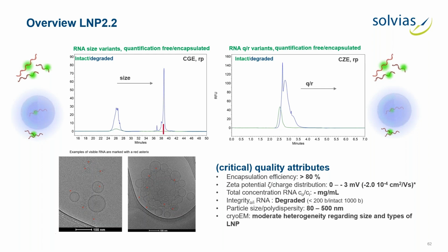It is really interesting to note that the RNA fragments on the left side are in the same size range. It was really astonishing for us and we have no answer. And the TEM picture reminds me of soap bubbles, but the spheres are to some extent really perfect.